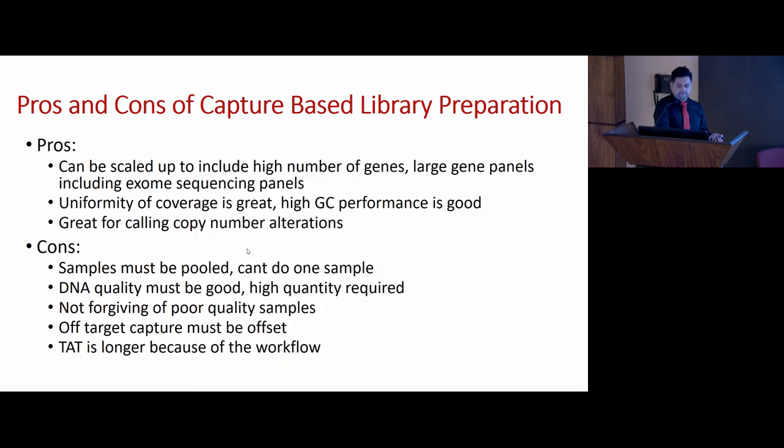Alright, and off target capture must be offset. TAT is longer because of the workflow. Typically you are looking at 4 to 5 days, or at least 3 to 4 days, for doing library prep. It is painful.